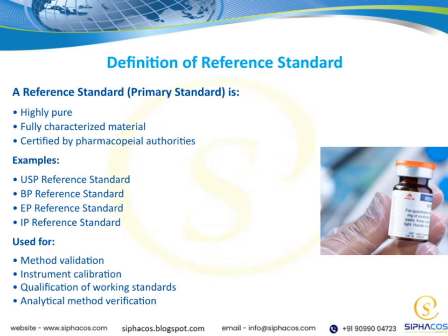These standards are essential tools for various purposes. They're used for method validation, to confirm that our analytical techniques are accurate and reliable. They help in instrument calibration, ensuring our equipment provides precise readings. They are also critical for qualifying working standards, verifying that our day-to-day standards are consistent.